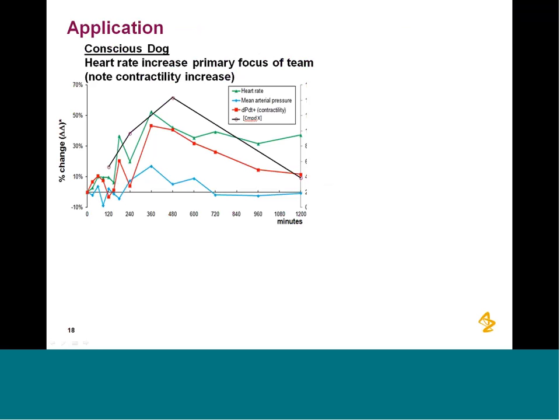Contractility is also going up, and it seems to mirror exposure to the compound. There's not a lot of information, but the project team sees rate as the primary concern. And so they asked me if I would, even though we haven't really rolled this out internally, test, and they only wanted human data. So I said, all right, I'll use the CDI cells. And they want human data, and they want to see if I can replicate the rate effect. So they have a bias coming in, and that's what I have to replicate.